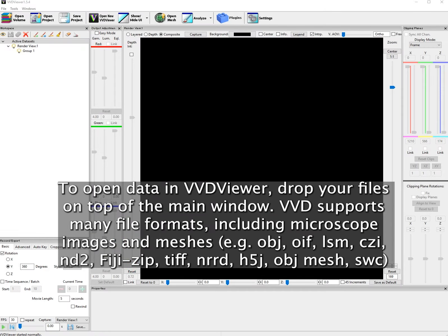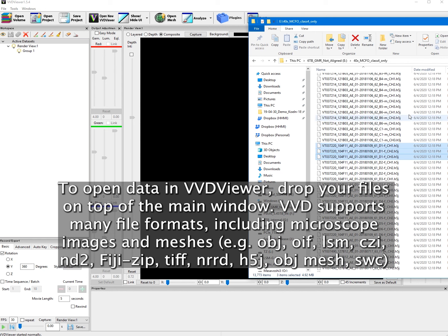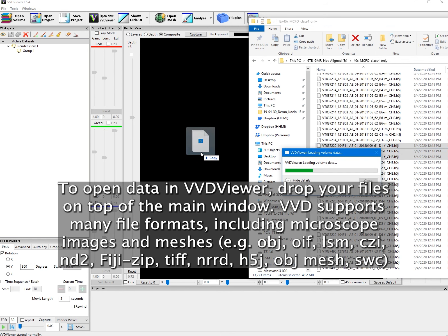To open data in VVD Viewer, drop your files on top of the main window. VVD supports many file formats, including microscope images and meshes.